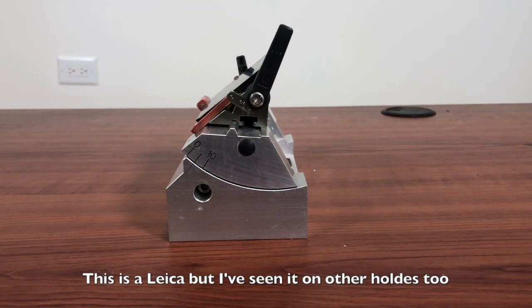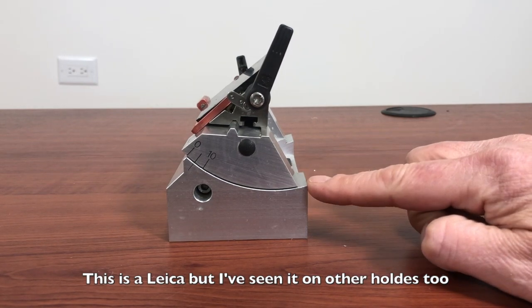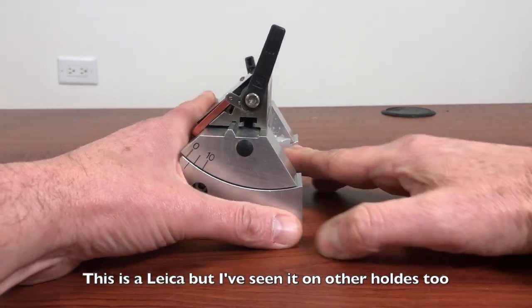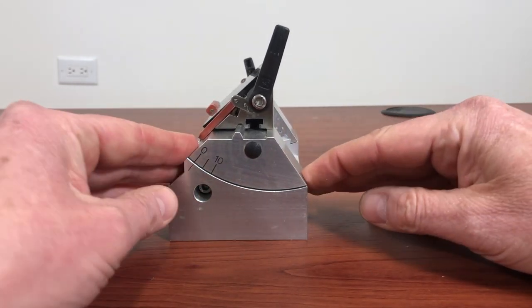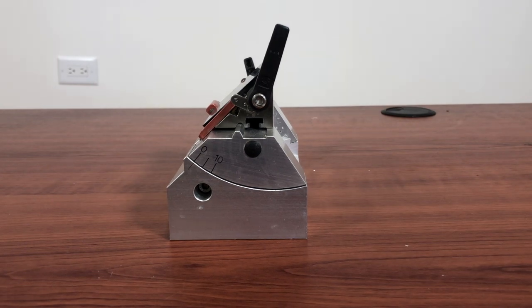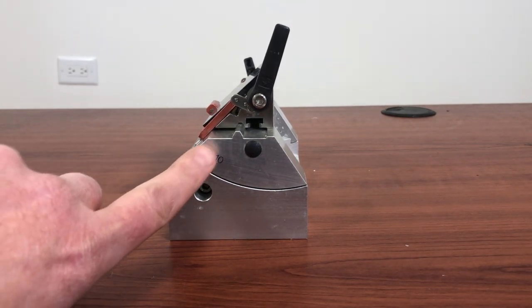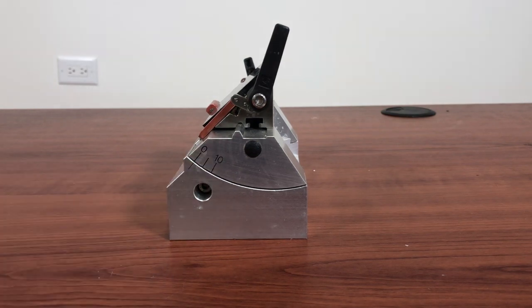Another thing I see pretty regularly is that people will think these two edges should line up and these two edges should line up, and they'll move it so that they are lined up. And yeah, it looks neat, but now your blade angle is at zero, and when you're cutting you're actually hitting the back of the knife instead of the edge of the knife — so just something to be aware of.